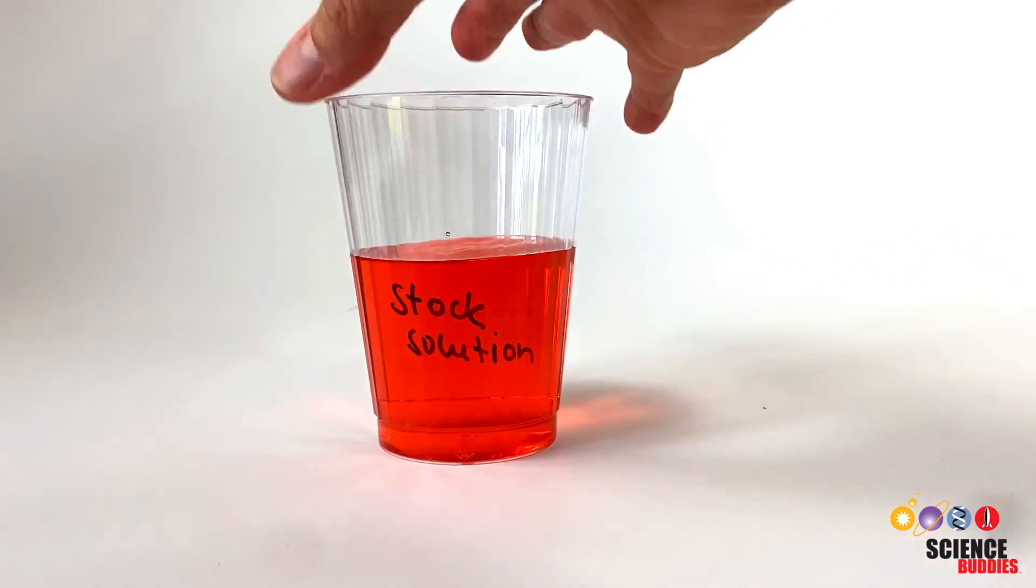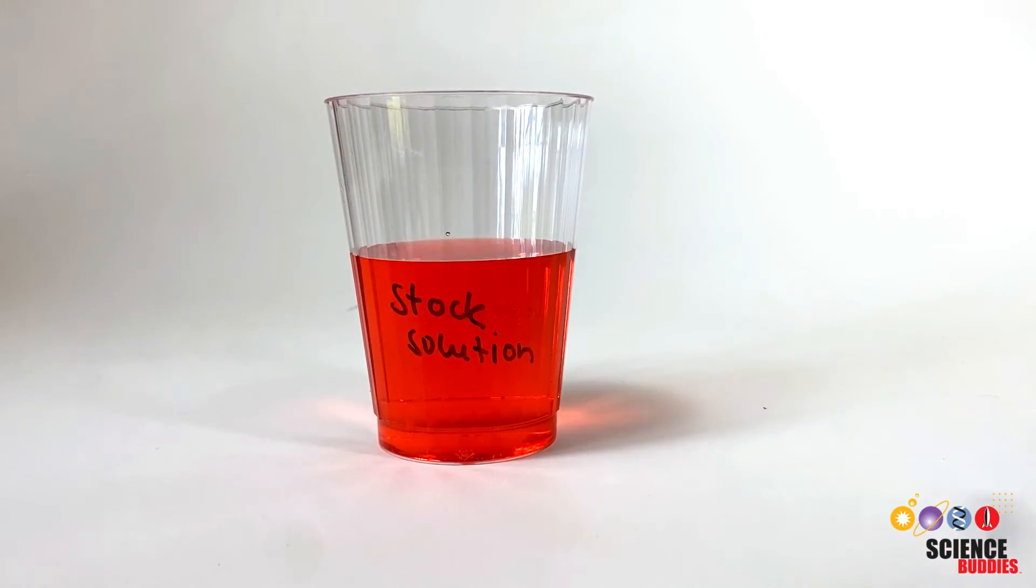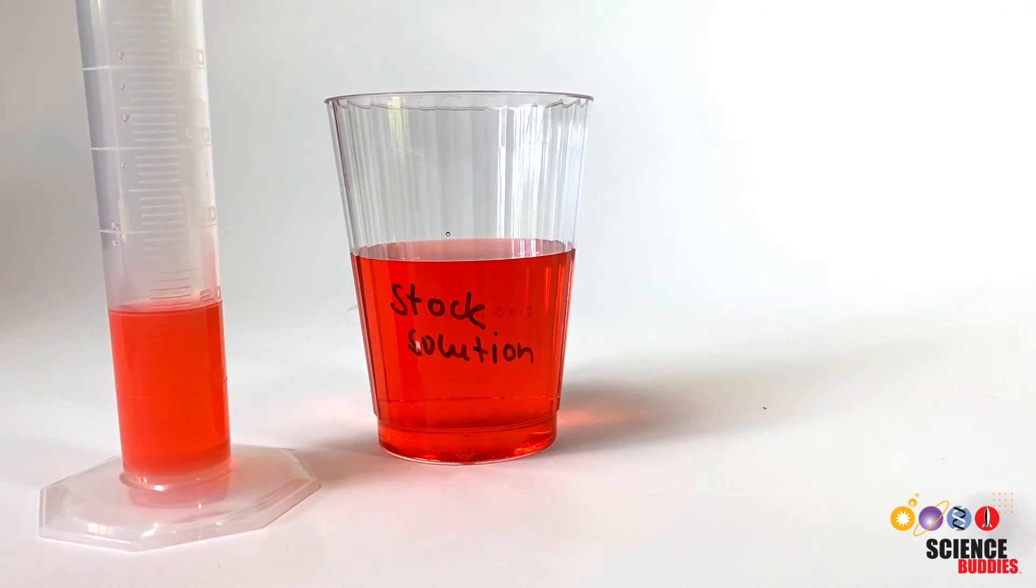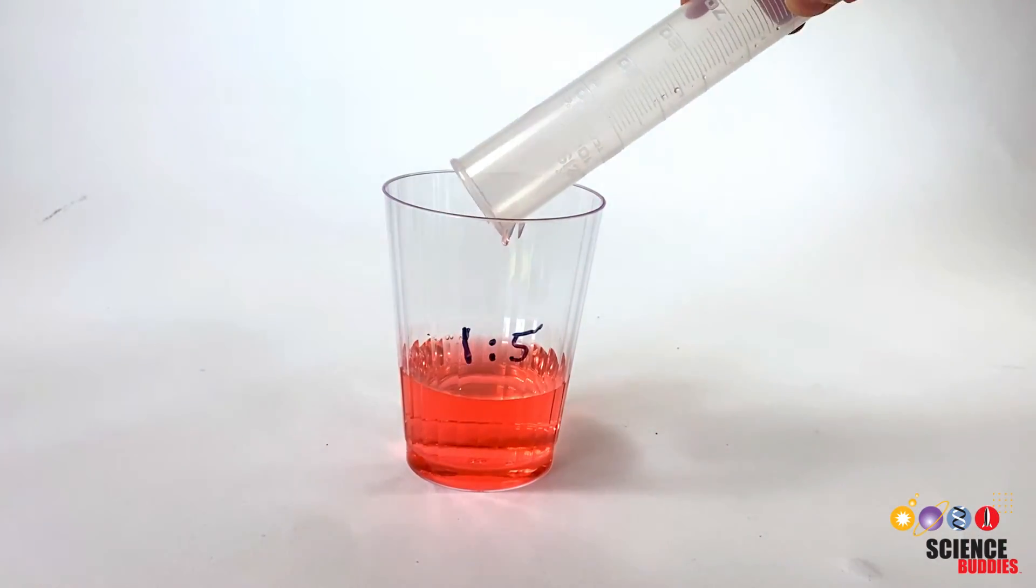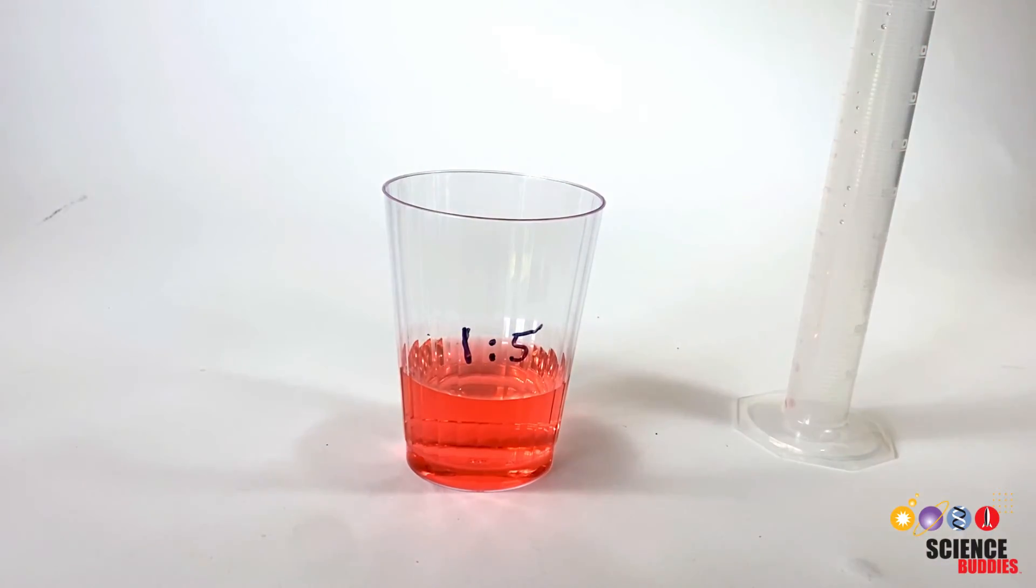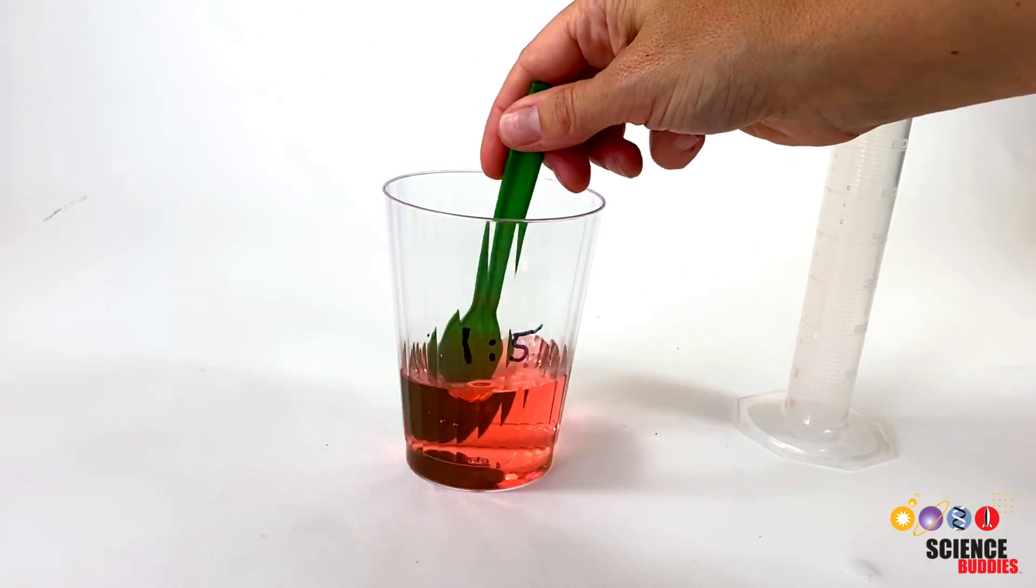Next, we need to add the desired volume of our stock solution. We can measure the required volume in a graduated cylinder or use a graduated transfer pipette for smaller volumes. We add the stock solution to the water and stir until everything is evenly mixed. Now, our 1 to 5 dilution is ready.